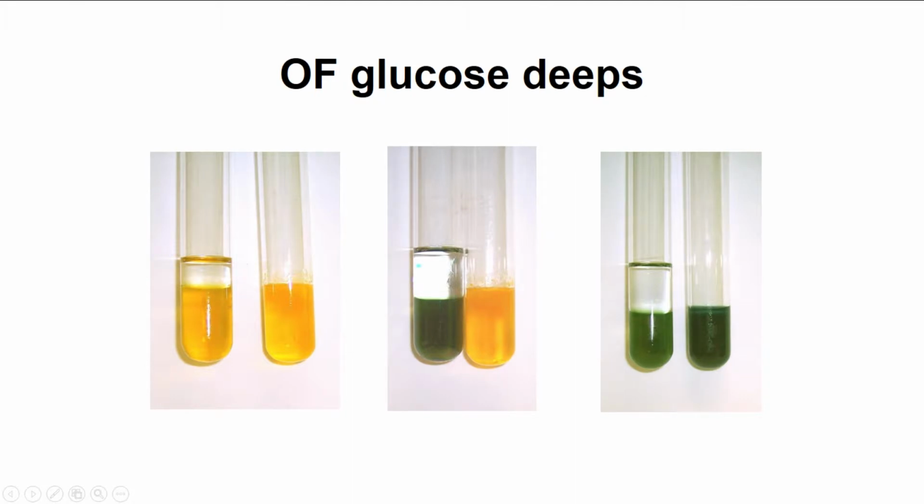Now, normally the media is in these green settings. So usually green just means nothing's happening. It's neutral pH, nothing's occurred. And so if you have a green tube, that means the bacteria was not able to utilize the sugar at all. It couldn't utilize it in oxygen or in the absence of oxygen, so this is just non-saccharolytic. That's how to record this.